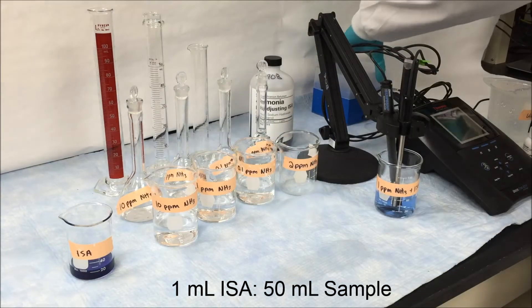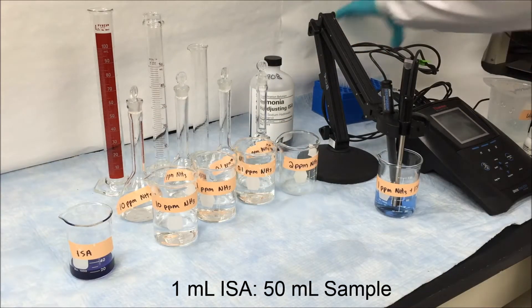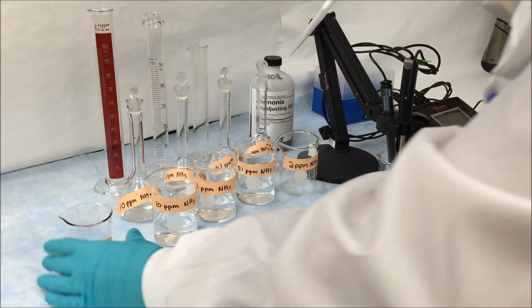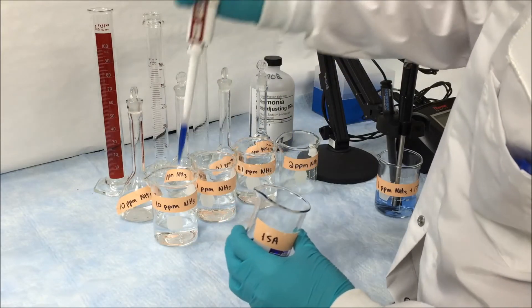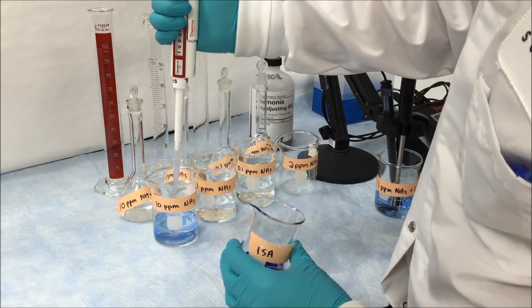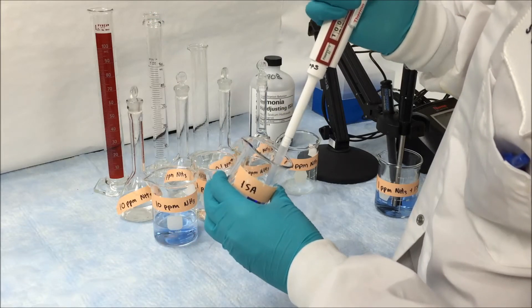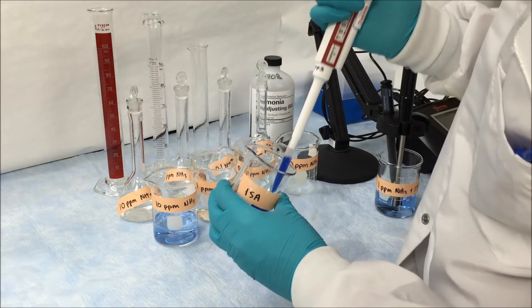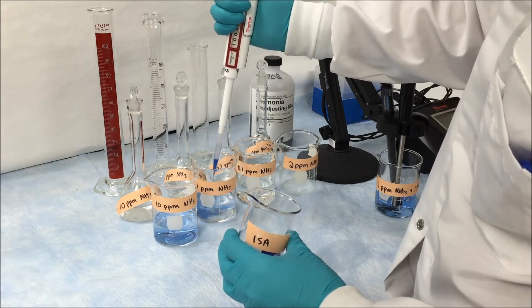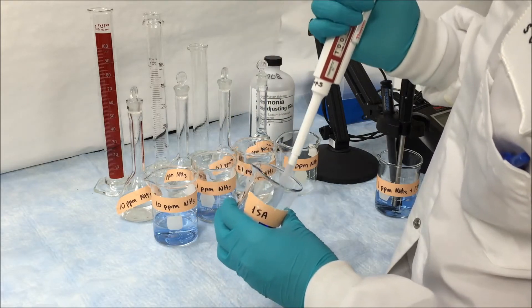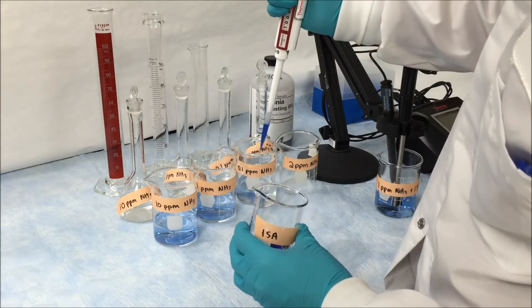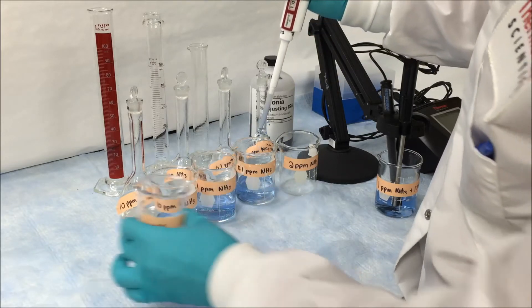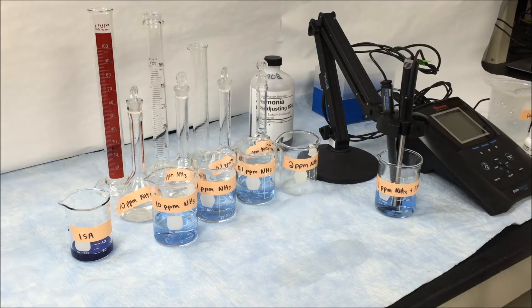Once all the solutions are poured, we're going to add our ISA. Since we have 50 milliliters of sample, we're going to use 1 milliliter of ionic strength adjuster. Using a fresh pipette tip and making sure you have a full milliliter of solution, slowly add 1 milliliter to each sample. You want to make sure that you add your ISA right before you do your calibration since ammonia is a gas. The longer the ISA is in your calibration standard, the more gas you have a chance of losing.